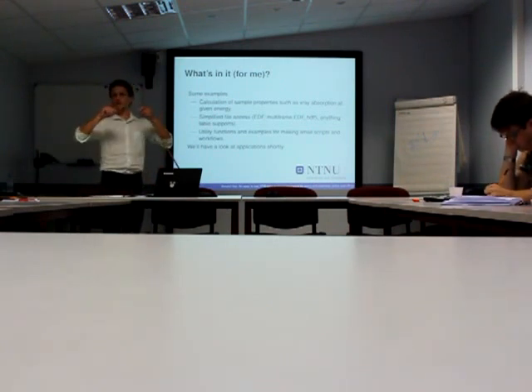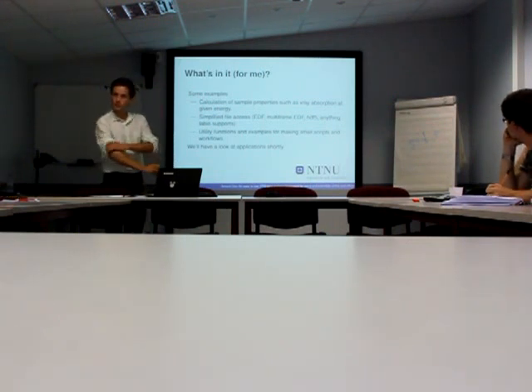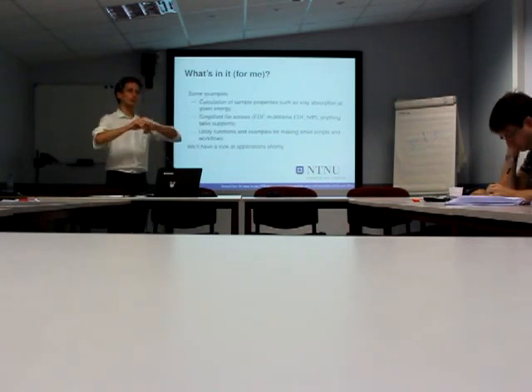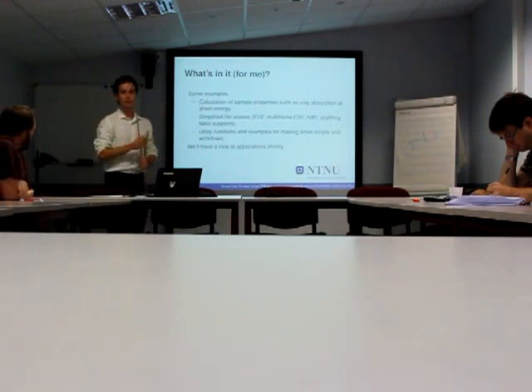It's like a container, you can put lots of data sets in it and then group them and so on. So it's quite flexible and optimized for large arrays. So I have some utilities for reading this. You can specify a whole list of files that you will read, even multi-frame EDF files.